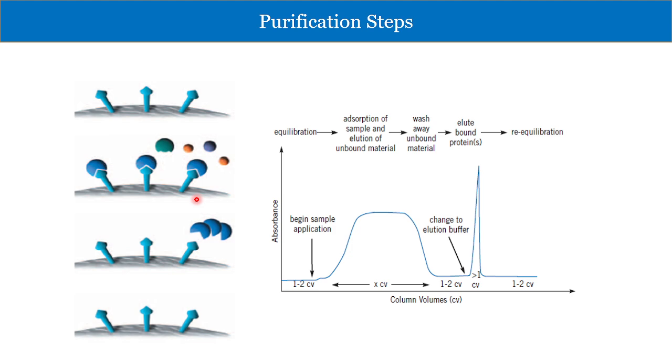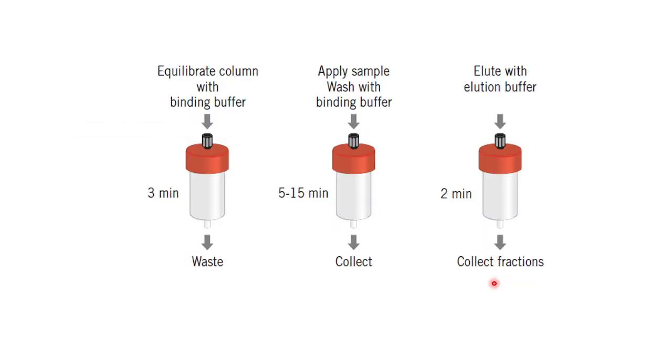That often happens in ion exchange chromatography, or even in size exclusion chromatography. Two proteins of similar molecular weights can elute at the same place, so you do not get a very pure protein. That is why in affinity chromatography, you know that your protein of interest has a better affinity for that particular ligand. You use that ligand to make your column, then you load your protein followed by elution, and you get a pure protein.